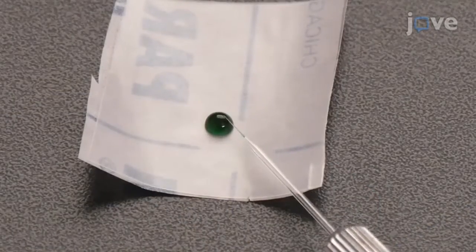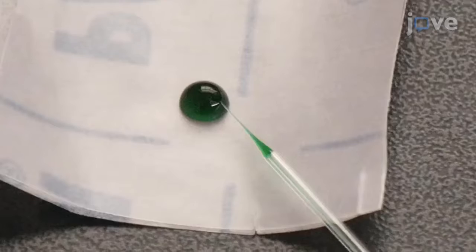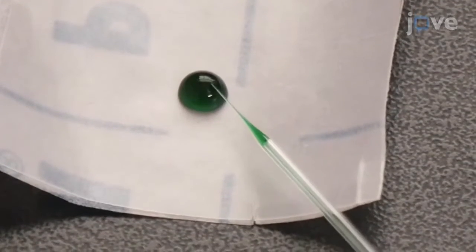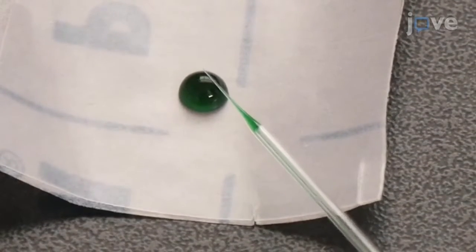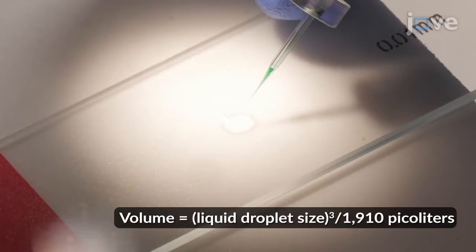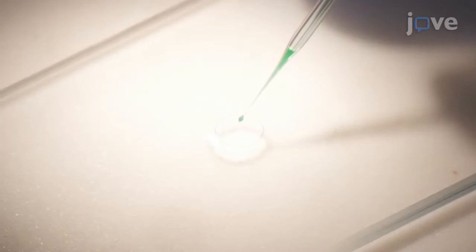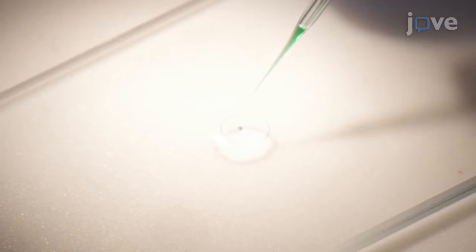To measure the volume of liquid that will be injected into each fly, load a capillary needle with sterile 5% food coloring in PBS, and expel the liquid onto a drop of mineral oil on a 0.01 mm stage micrometer.